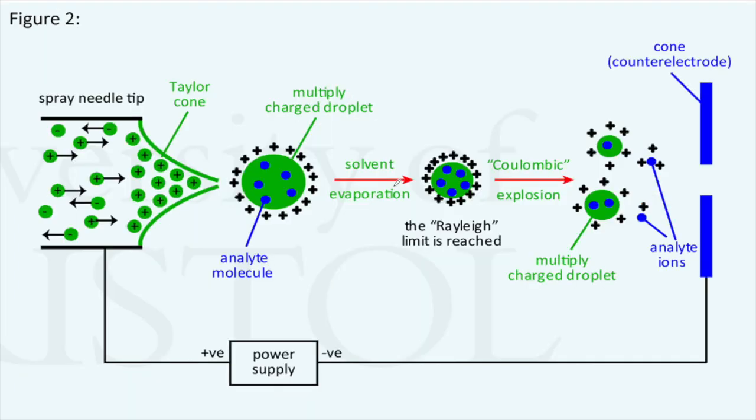And so here's a zoom in. This big voltage drop here creates these droplets with a lot of charge that, because the charge repels itself, kind of surrounds the outside of this big droplet. On the inside of the droplet, I've got solvent molecules, again, typically water or methanol, and I've got some of what I call the analyte, which is the stuff I actually care about.